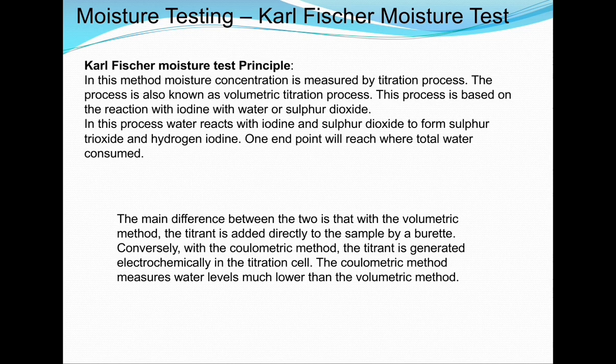We have discussed various methods, and another most important parameter is TAN, that is the total acid number. Total base number, TBN, is also there, but in the oil normally the base is not tested, as the acid number increases during the use of the lubricants. So TAN testing is very important.